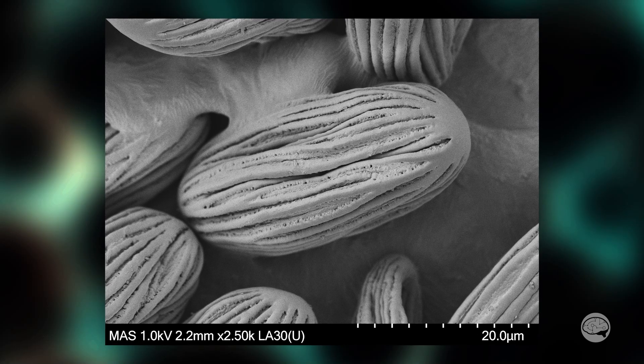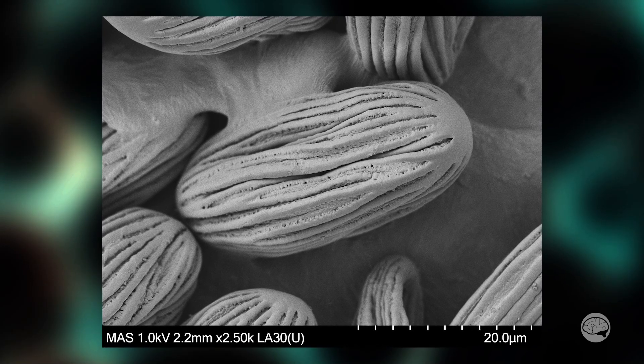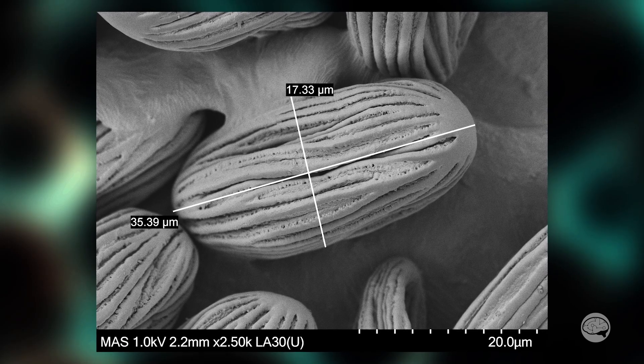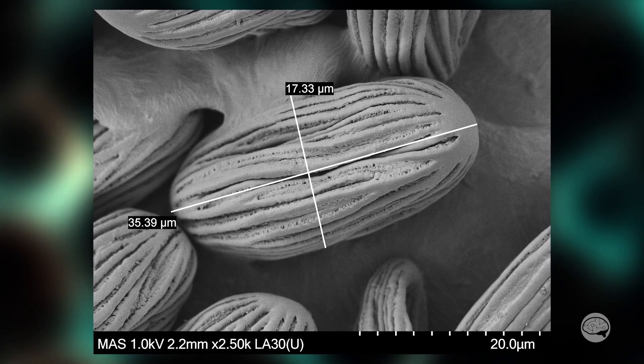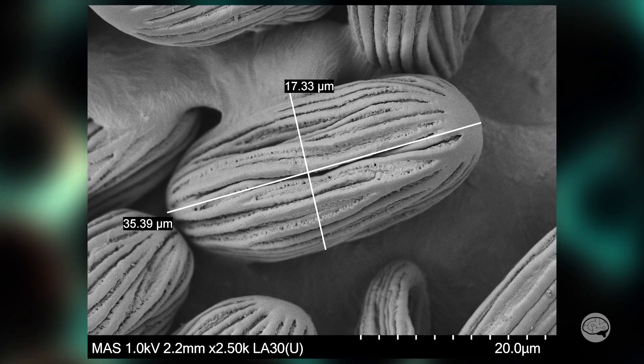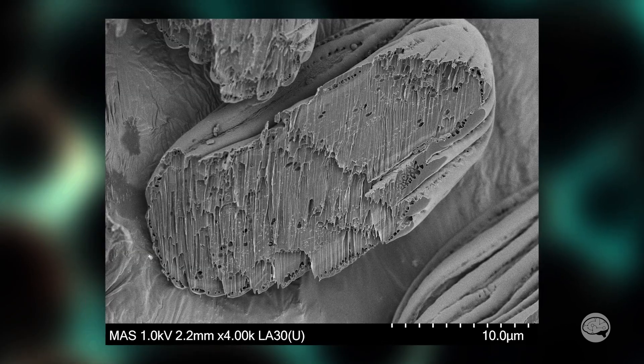Once in the SEM, we can actually see the surface features on these little guys and measure them. And yeah, they are pretty small — they're about 35 microns long. And to put that into perspective, the hair on your head is usually around 50 microns thick.